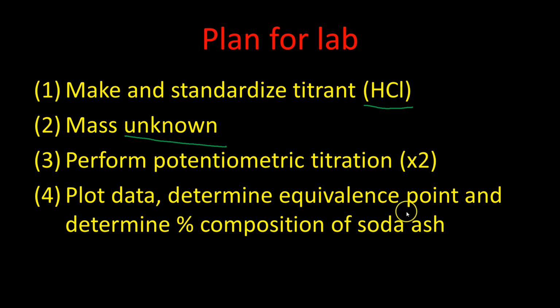From those equivalence points, you're going to be able to determine the amount of soda ash, and from that, you're going to determine the percent composition of your unknown.